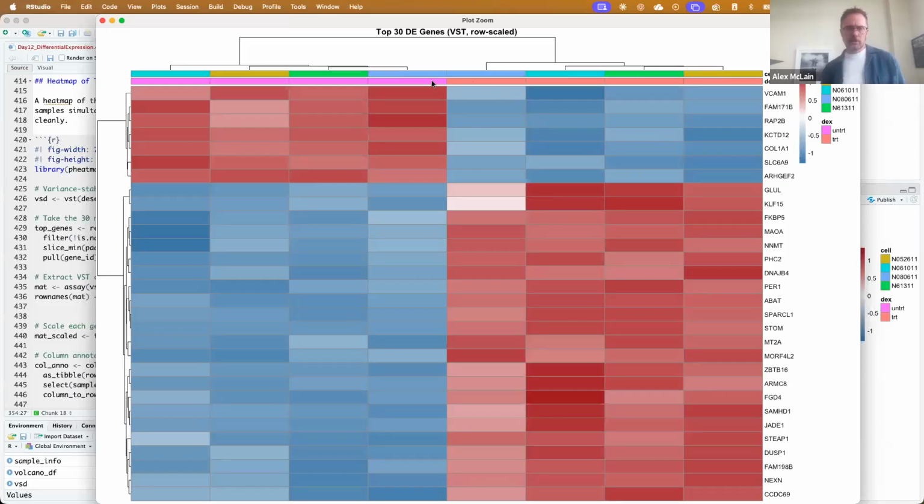We can try to look at some of the cell relationships here. It is a little bit challenging, though, to compare the similar cells with how they look to one another. But you can see those cell markers at the top there. Yeah, so there's a clear block pattern here, which is nice. I think that's something that we would want to see. So there's a strong treatment effect among these top 30 genes that we identified.